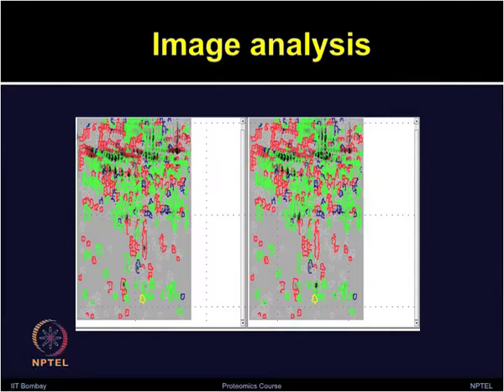Now, when authors analyzed these DIGE images, they found that 63 protein spots were differentially expressed between the Gleason score 5 and 7 cohorts, and 13 of these proteins were statistically significant among these two populations. So, as you know, analysis of these gels is always challenging, especially if you are looking at the conventional 2D gels, where you have separate gels obtained from each of these groups.